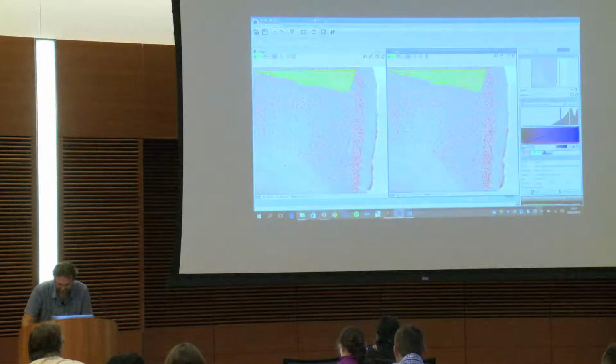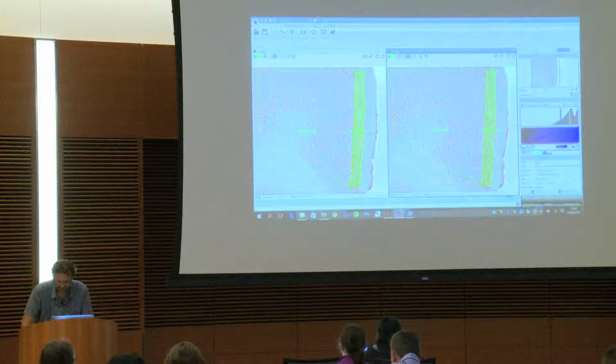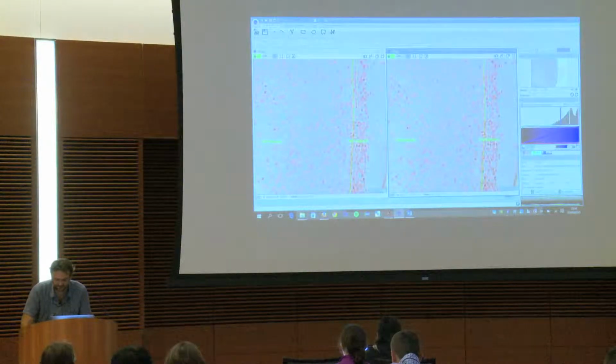No? Okay, so I will create an ROI here. And by the way, I will show you the different kinds of ROI that we have. And another here. You see, I can do something like that, but after, if I want, I click here and I can refine it.